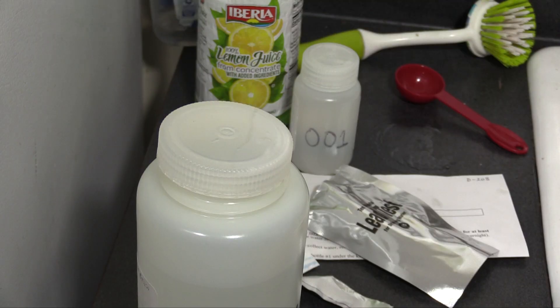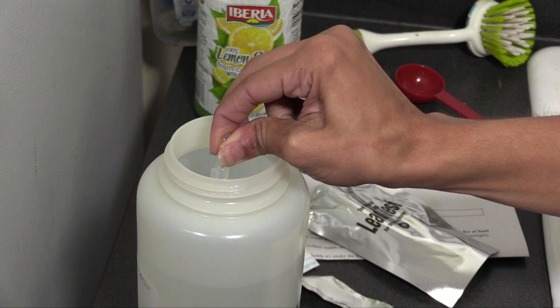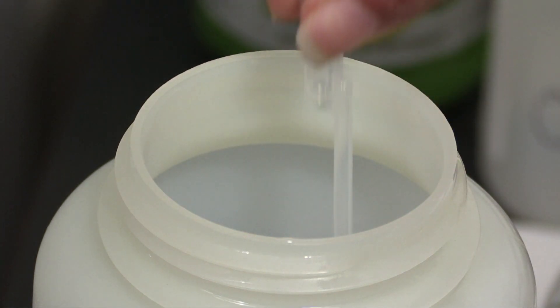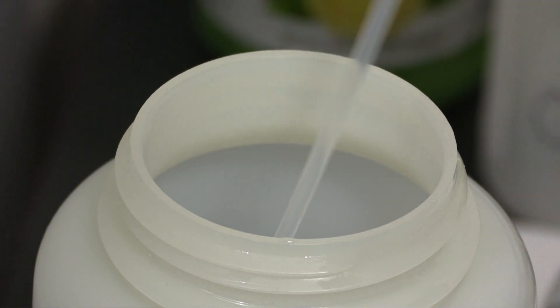Using the large bottle, submerge the end of the dropper in your water sample. Squeeze the bulb at the top to push out the air, then let go to fill the dropper with water. Make sure that the lower bulb of the dropper is completely full before proceeding.